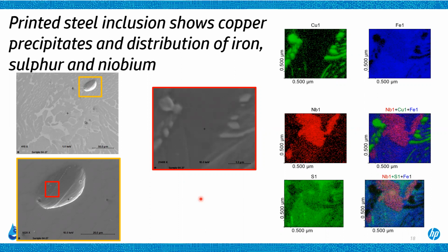One of the most common uses of electron beam Auger, back in the old days, if you will, was to look at metallurgical samples. In this case, we're looking at a cross-section that has some inclusions. We can zoom in on these and you can see there's some particles here. And the question, of course, is what is it, and where are they, and how do things fill in?